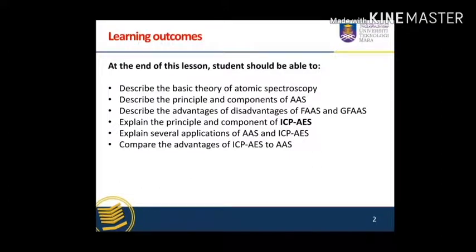So this is our learning outcome for today. At the end of the lesson, I hope students should be able to describe the basic theory of atomic spectroscopy, describe the principle and components of atomic absorption spectroscopy, and describe the advantages and disadvantages of flame atomic absorption spectroscopy and graphite furnace atomic absorption spectroscopy.